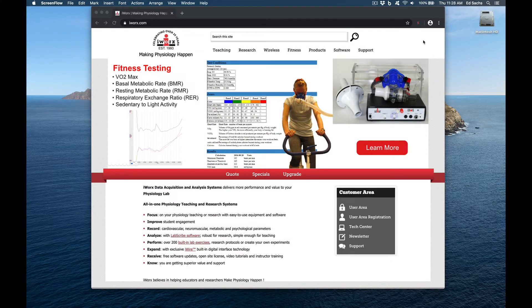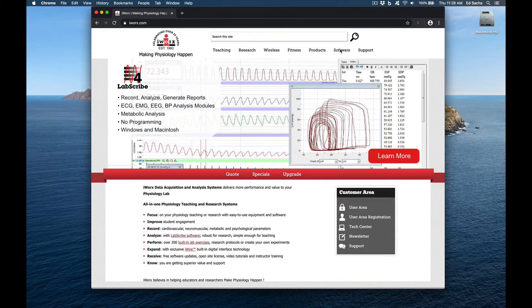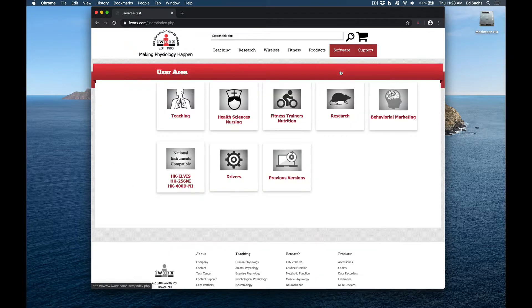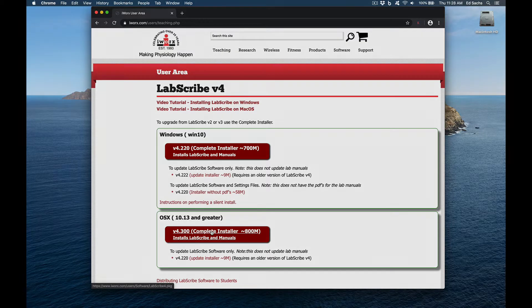To download Labscribe, go to the iWorks website, choose Software, Downloads. After putting in your username and password, go to the Teaching section, download the OSX complete installer.